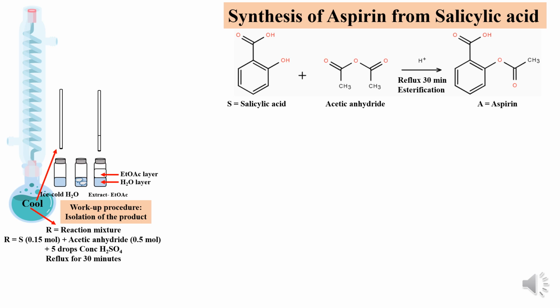Take another fresh capillary and touch the tip of the capillary to the ethyl acetate layer, whereby aliquots of the ethyl acetate layer are transferred into the capillary by capillary action.